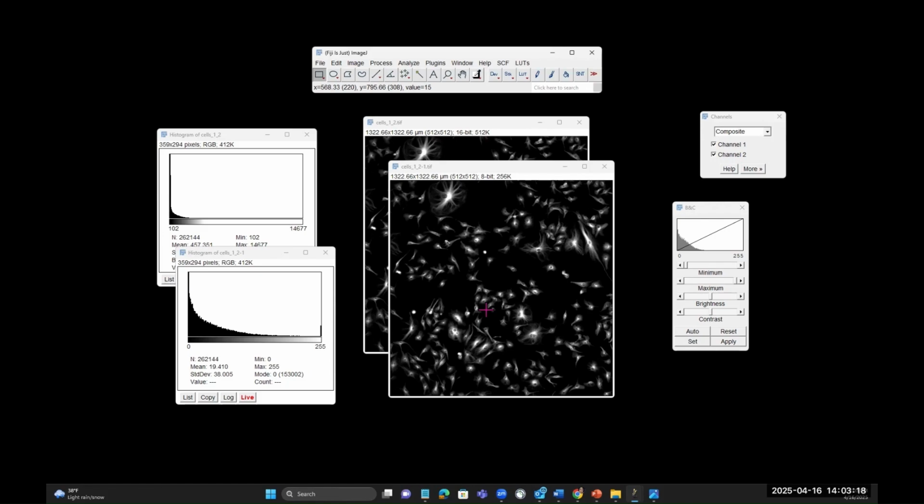So the key message here is that it is really easy to change the bit depth and the type of your image, but also very easy for things to go wrong, especially in terms of analysis. These errors can be really small, but they may also destroy your data.